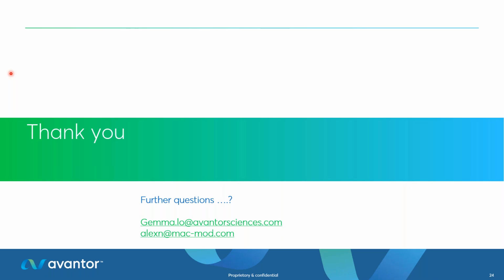Okay. Next question. C18 is usually a starting point for a project. If the C18 doesn't work, do you have a particular selectivity that you like to try after that? I think if you know anything about the structure of the analytes, that often guides us where to go next. So for example, if I can see there's a lot of aromatic groups on the analytes of interest, I'd probably go for something like the C18AR. That one seems to work really well for those aromatic compounds.